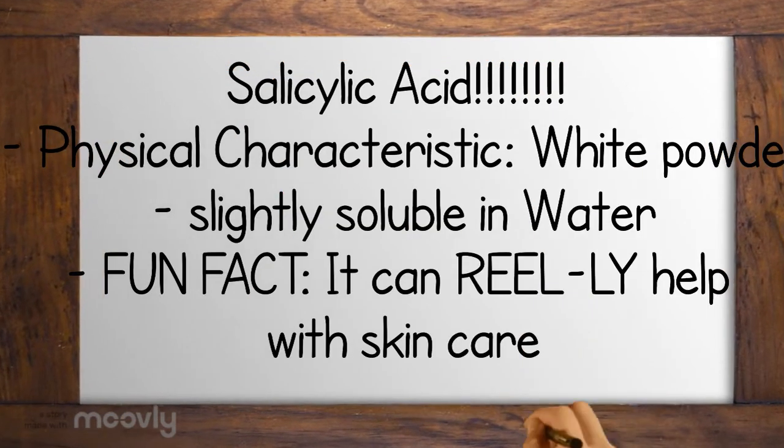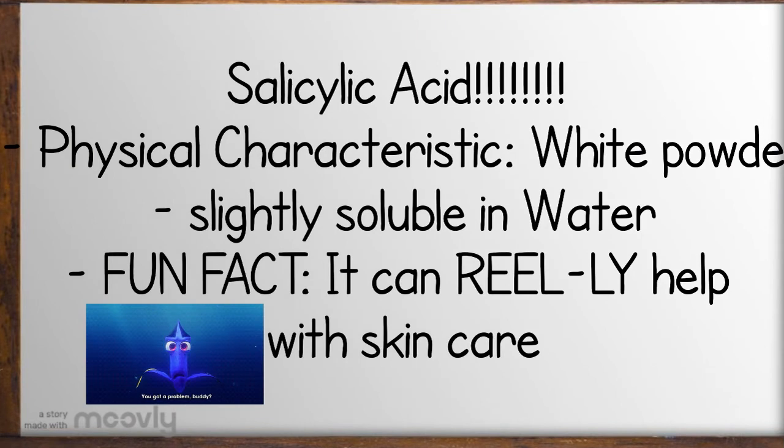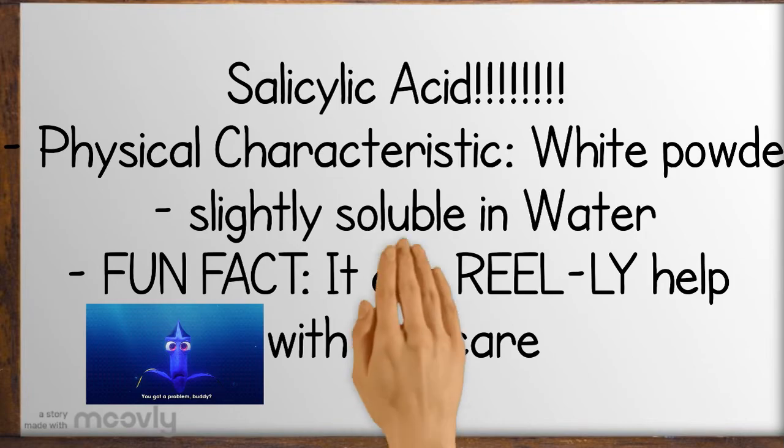Our unknown substance is salicylic acid. This substance can be found in a white powder form. It's slightly soluble in water and soluble in ethanol, chloroform D, and ethyl acetate. Fun fact, it is often a main component in skincare products as it helps clear acne.